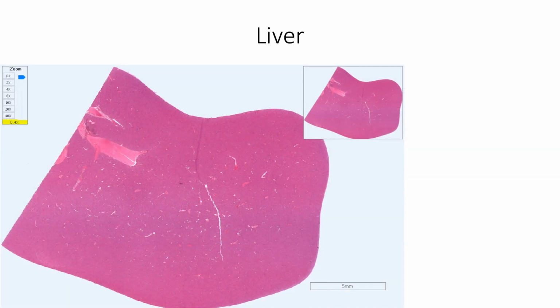Liver is the largest internal organ located in the upper right abdomen. Except at the bare area and sites of attachment of peritoneal folds, it is entirely covered by serosa. Beneath the serosa, it is covered by a thin Glisson's capsule made of connective tissue, and this capsule sends in trabeculae carrying branches of portal vein, hepatic artery, and bile ducts called as portal tracts.